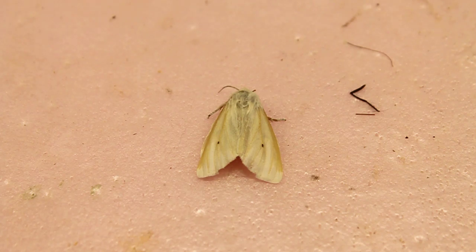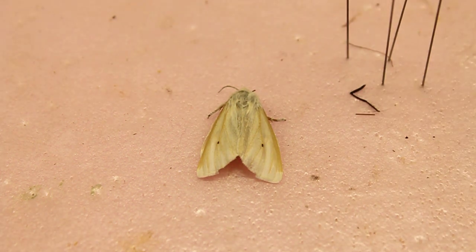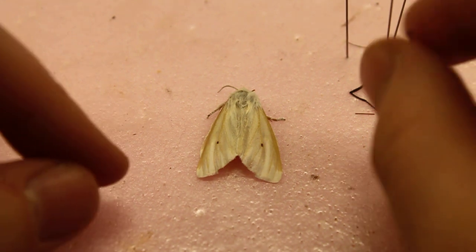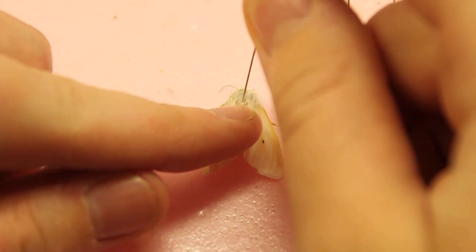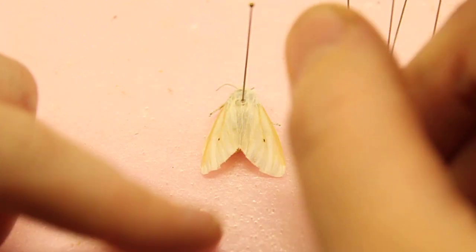Okay guys, round two. Today I'm going to be pinning this moth, hopefully this video will go better than some of the other ones I've been trying to make. I'm getting some pins and I'm going to pin this moth in the thorax — it should be right here — there we go.